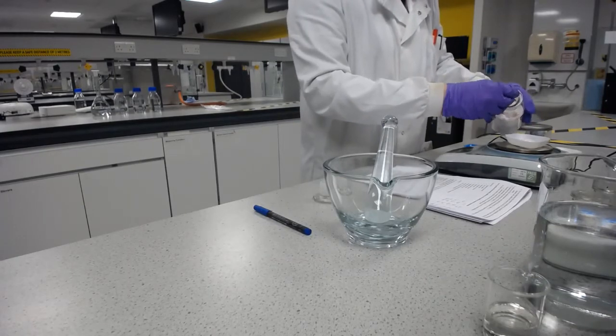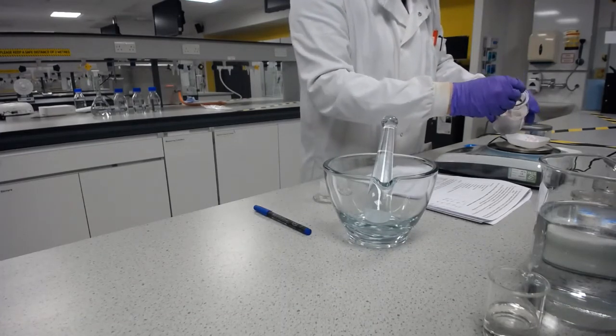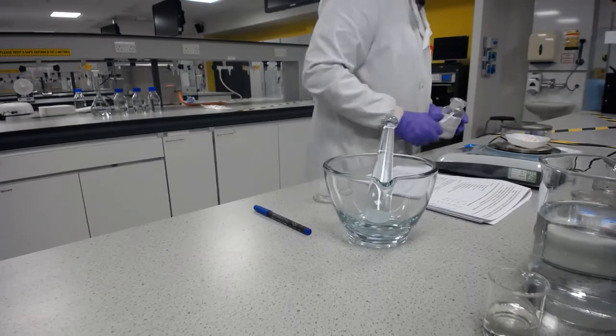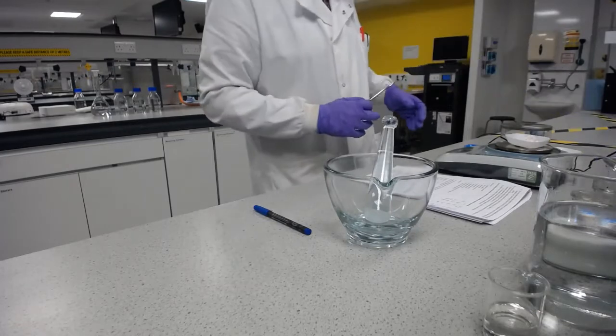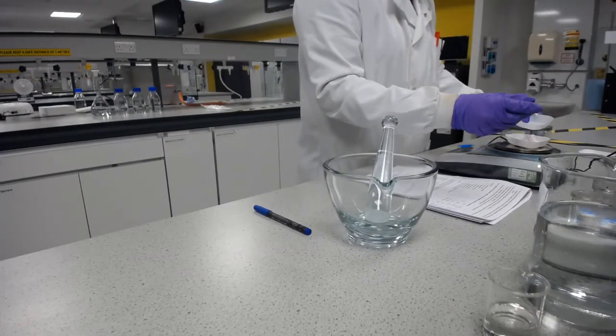This is a very light powder. It's not very dense, so you'll see that I have to start putting in quite a lot. And again, I'm doing this on the balance, but if you're not going to clear up any powder that you spill, or you're worried about spilling too much powder, then you wouldn't do this on the balance.